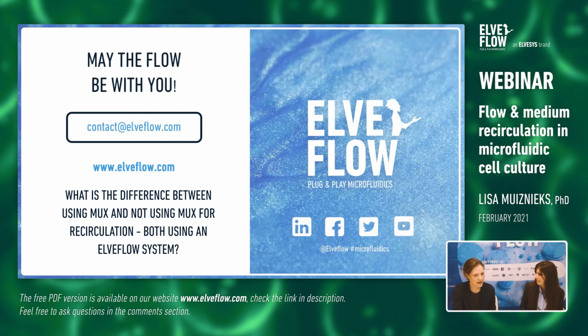However, the one difference between your system and using the MUX recirculation is that if you have two channels in your chip that you want to recirculate, one MUX recirculation is good for one channel, so you would need a second MUX recirculation. So I think you're right. It's true. That is the difference.